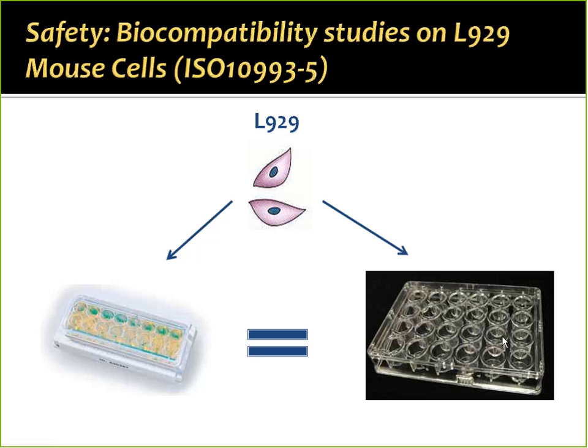And as I will show you in a moment, of course, that is not a very objective way of really gathering the data, because the cells can be rounded and detached at various percentages, and it's difficult to really give that a value or a number for cytotoxicity. So what we decided to do was place the cells side by side in xCELLigence e-plates, and then compare our findings.